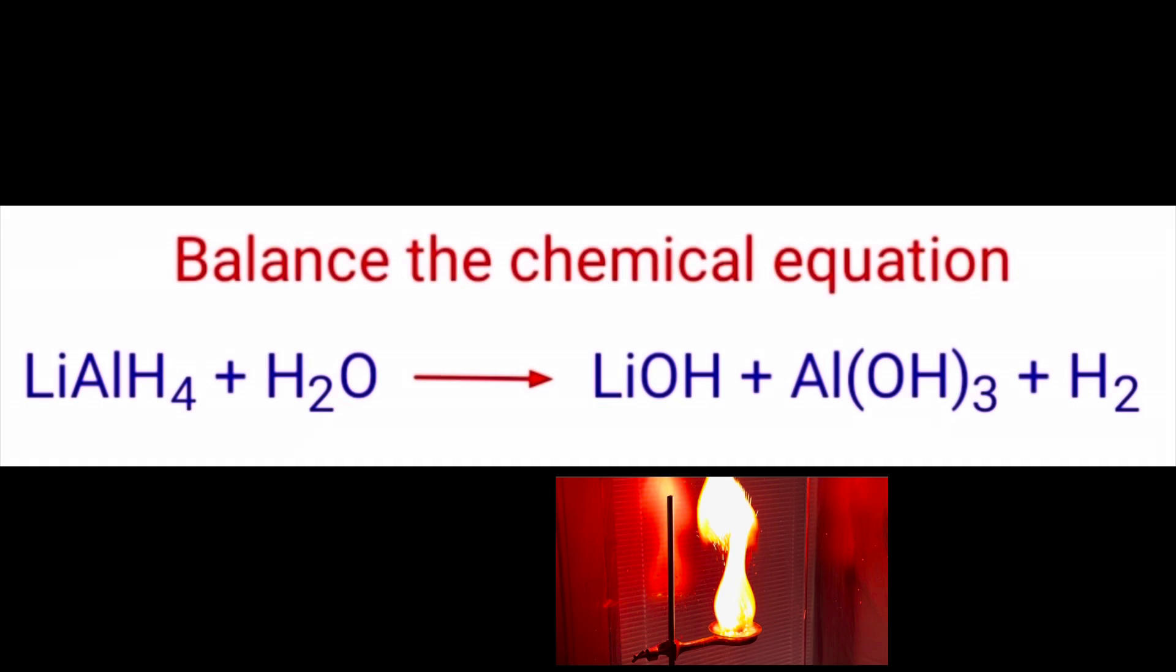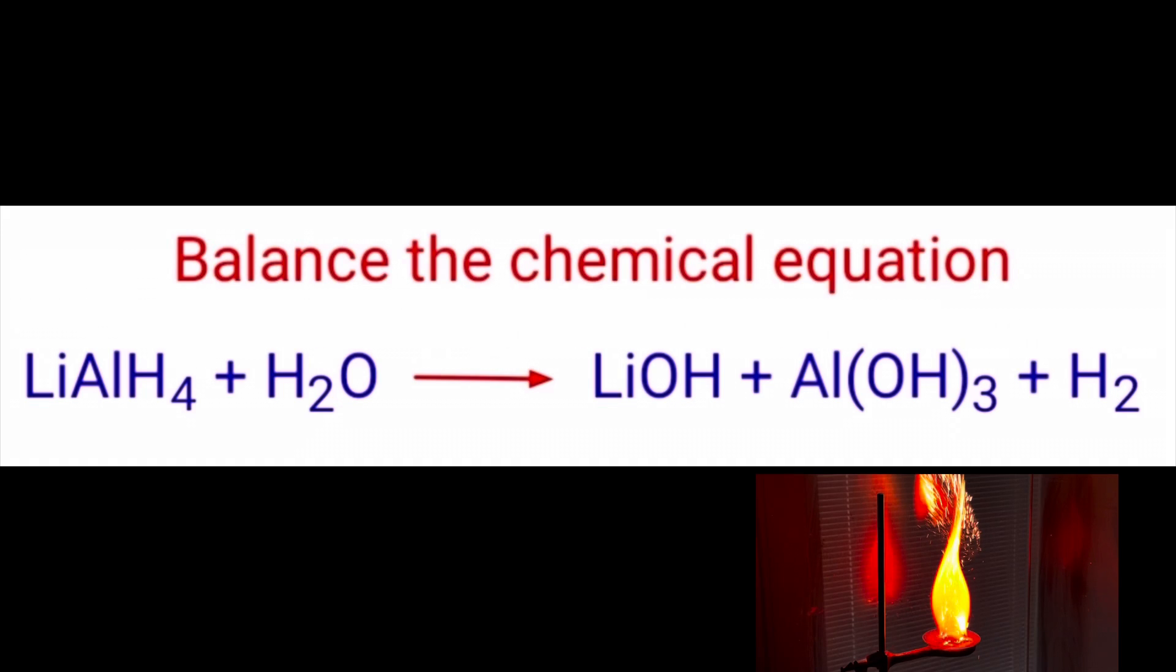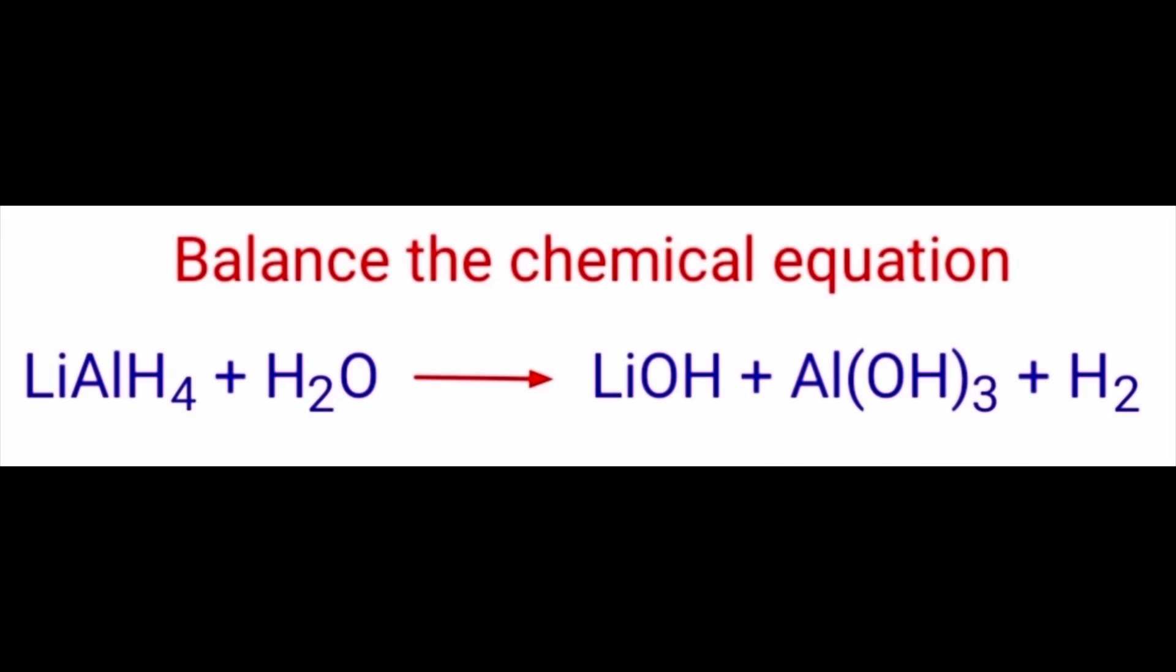This is a combustion reaction because when the reaction begins, it's so exothermic that as the hydrogen gas is released, it begins to combust. That's what causes that amazing flame you see during this reaction.